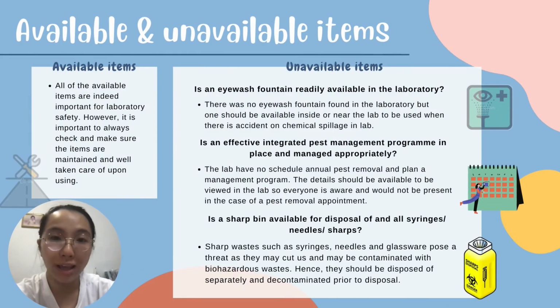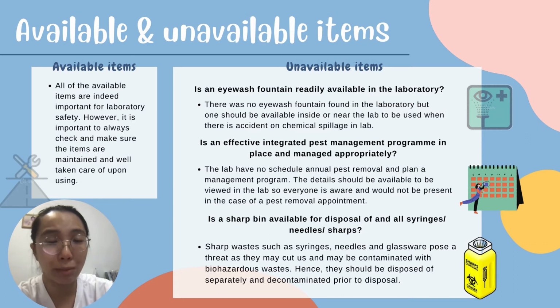Firstly, although the eye wash fountain is not seen in the video, it is assumed there is one placed outside or nearby the lab. An eye wash fountain is compulsory to be placed where the eyes or body of any person may be exposed to injurious or corrosive materials. Secondly, it is vital to have an integrated pest management program in laboratories as insects such as cockroaches may mechanically transmit disease pathogens and compromise the lab environment.